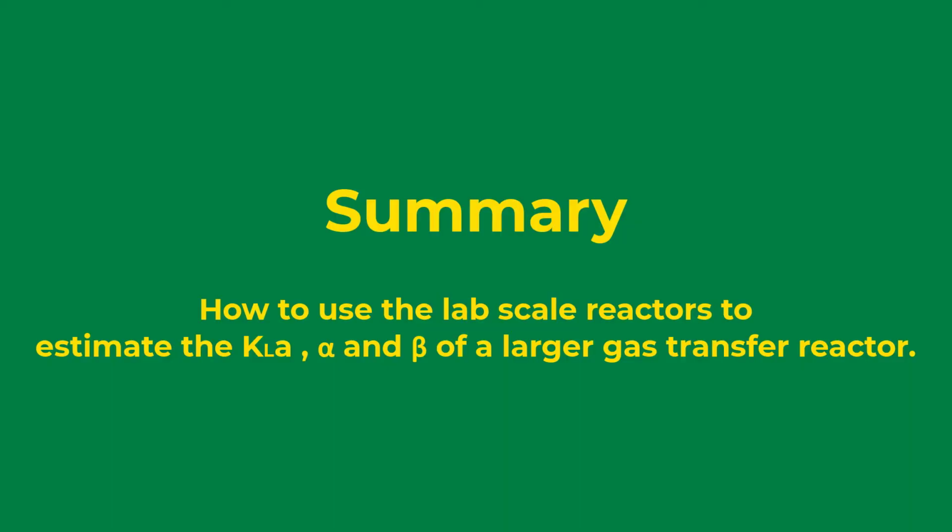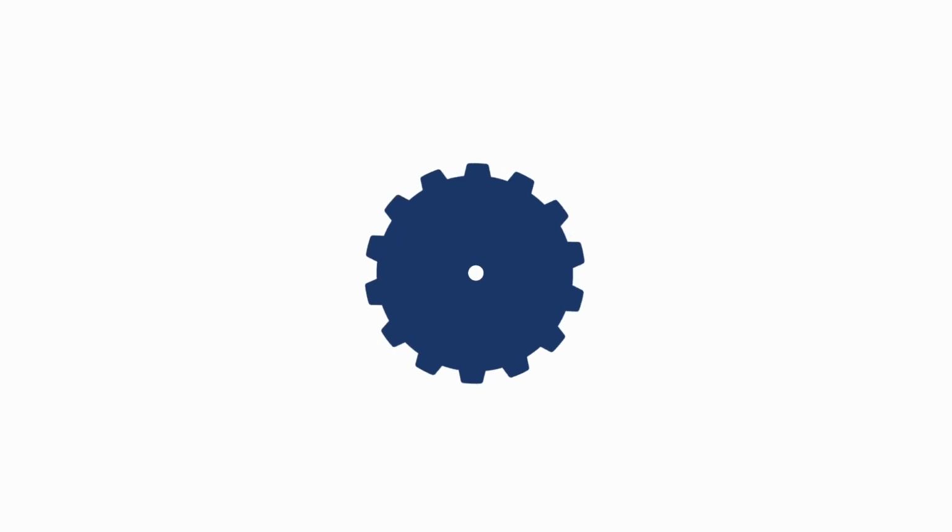After this lab, you should know how to use a lab-scale reactor to estimate the KLA, alpha, and beta of a larger gas transfer reactor. This data is important for the scale-up process.